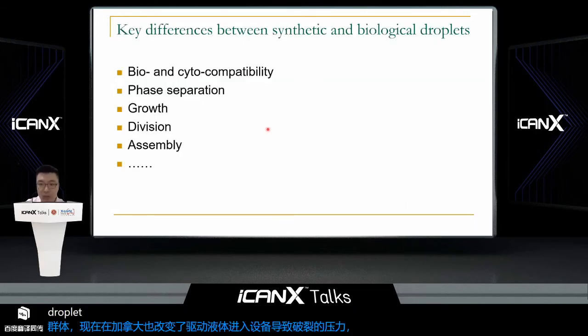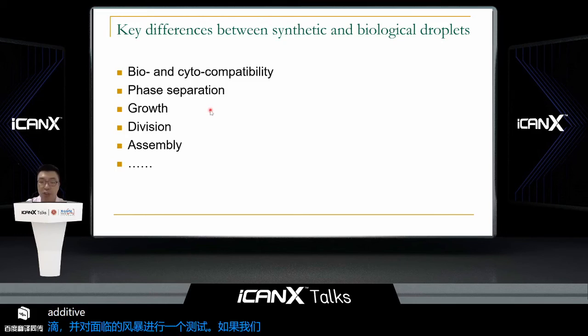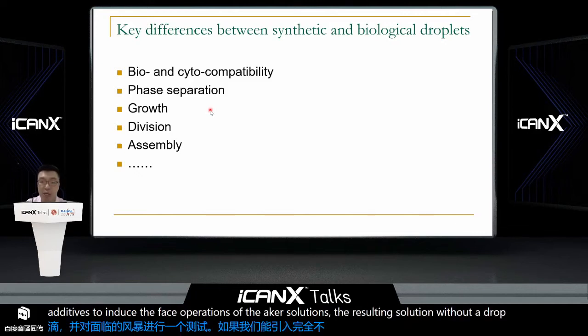With the aqueous two-phase systems, if we can just introduce completely biocompatible and cytocompatible additives to induce the phase separation of the aqueous solutions, the resulting droplets will be completely biocompatible or cytocompatible.